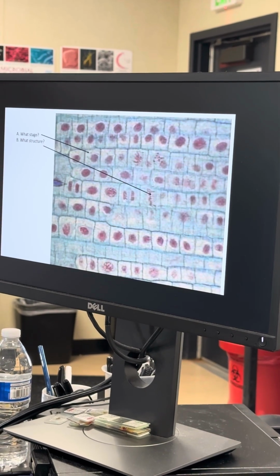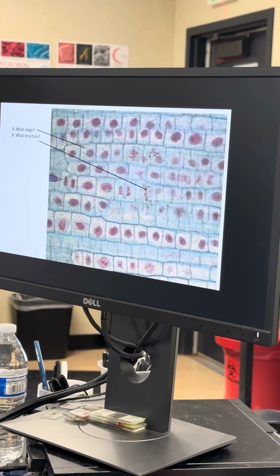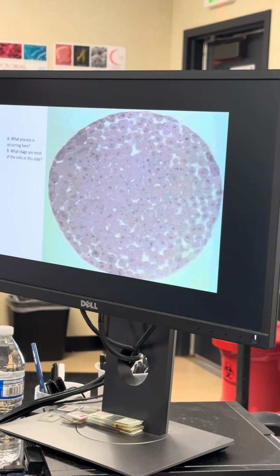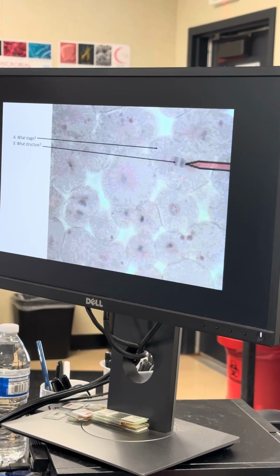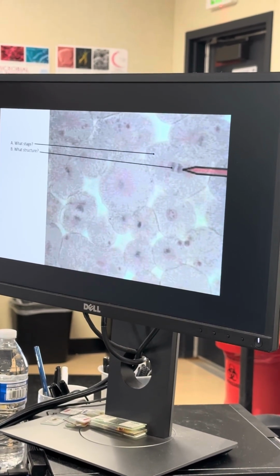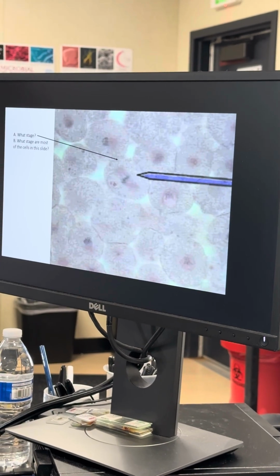These are all chromosomes. You're not looking at anything else but chromosomes here. And nucleus, of course, prophase. So telophase, anaphase, of course, another nice, beautiful anaphase, metaphase, prophase, everything else is interphase.